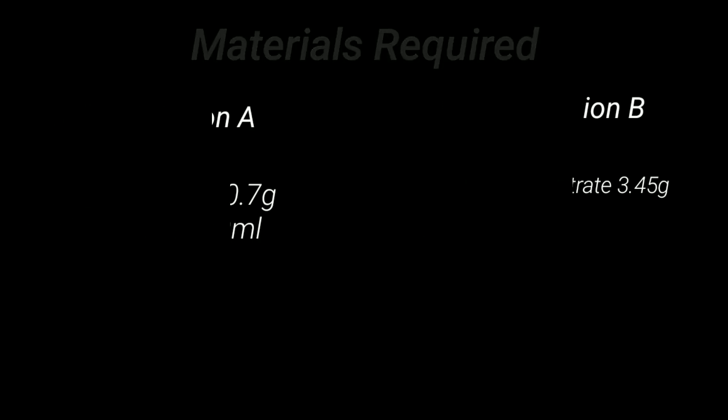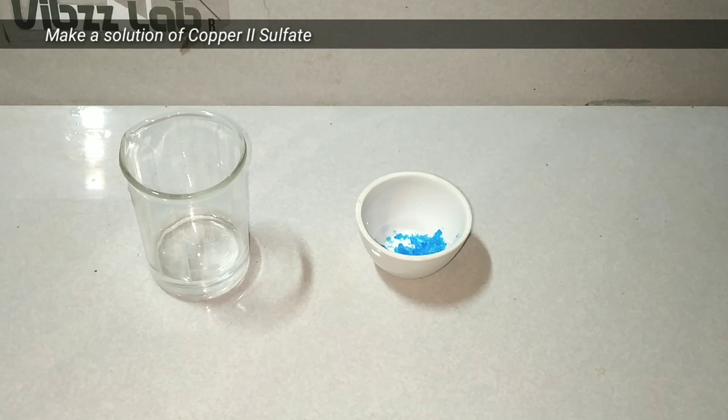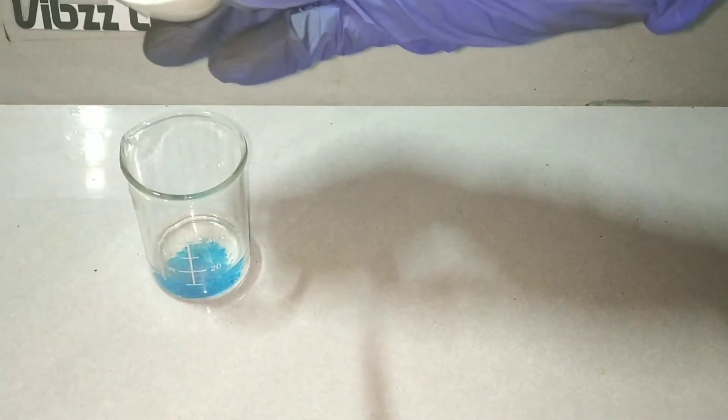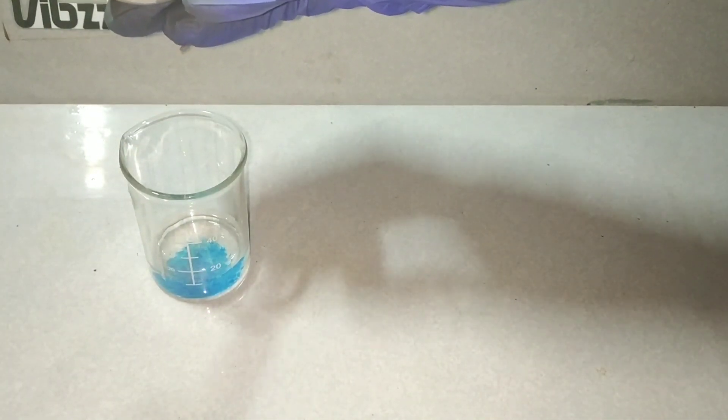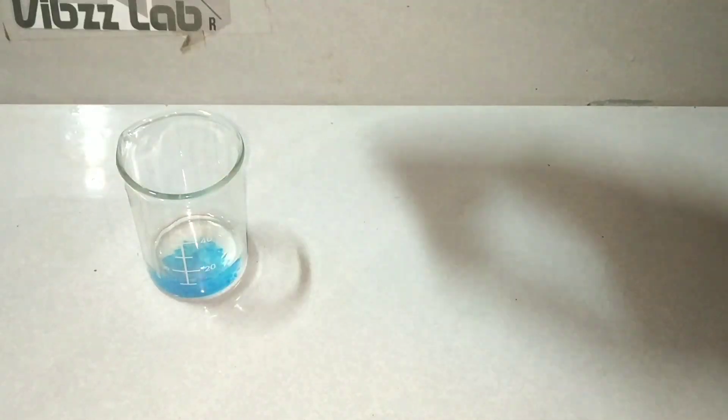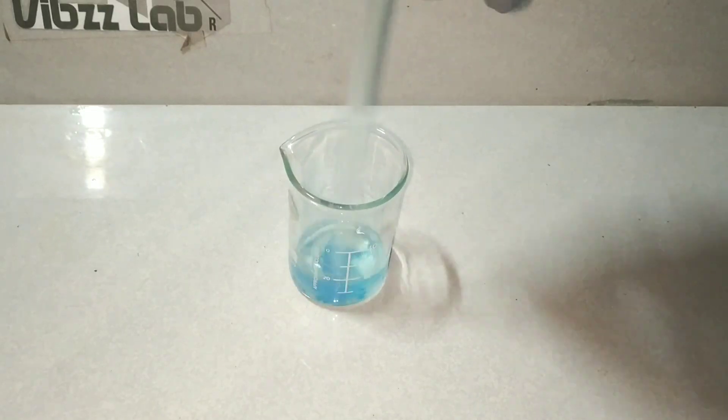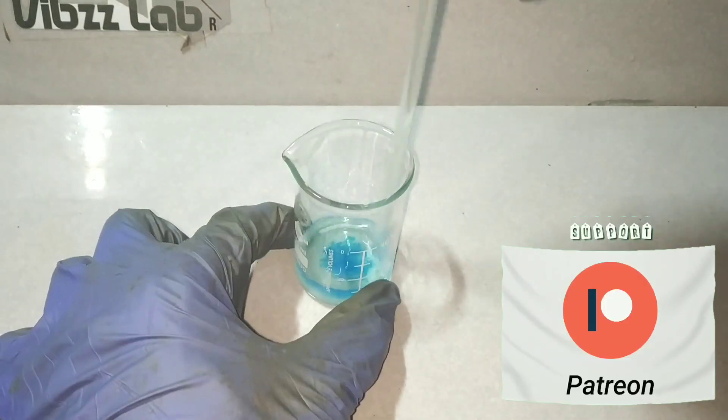Let us first make Fehling A solution, which is a solution of copper 2 sulphate. I have taken 0.7 grams of copper 2 sulphate to make 10 ml of the reagent. Copper 2 sulphate is pretty well soluble in water. If it's getting difficult to dissolve, just use some warm solution so that it will dissolve easier.